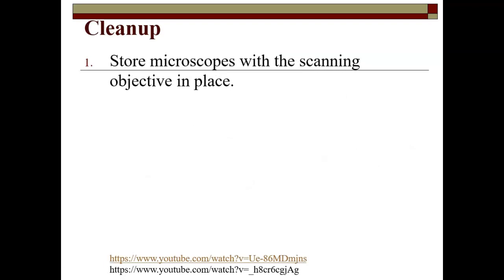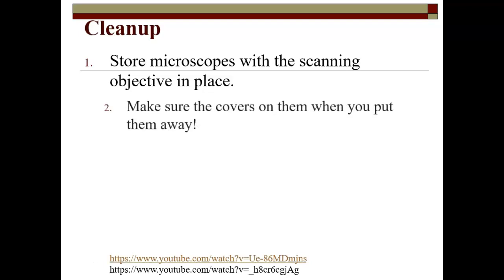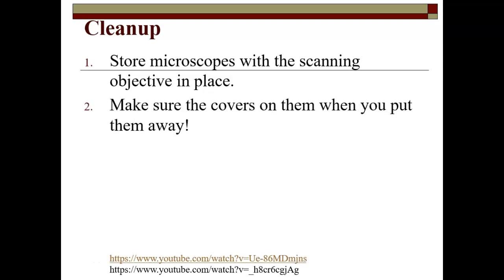And so when we are done with our labs, we will always clean up pretty much the same way. And we will go through this whenever we practice our hands-on microscope stuff too. But with our microscopes, we store microscopes with the scanning objective in place. If you remember from earlier in this note packet, the scanning objective has a red band around it. We always make sure that the dust covers are on them when they put them away, and that's just to keep them as clean and as nice condition as they can be.